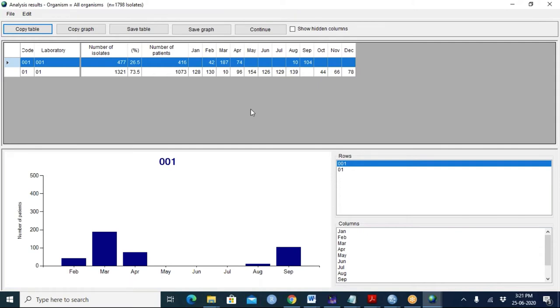Perfect. The purpose of this call is not to clean your data. The purpose of this call is to find issues. On the next call, we can talk about how to clean these things up. What I would like is for the configuration to be the same on the two computers. I want all of these to say 01. Right now we are finding issues. On the next call, we will talk about fixing issues. So it's basically cleaning in two parts. Part of cleaning is finding the issues. The other part of cleaning is fixing the issues. So that's a cleaning issue.